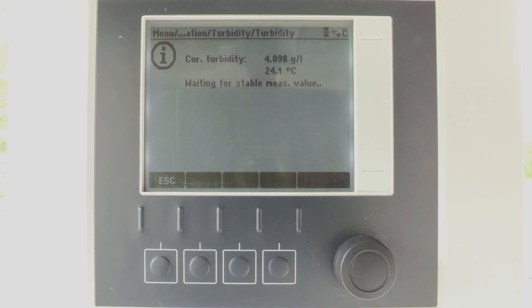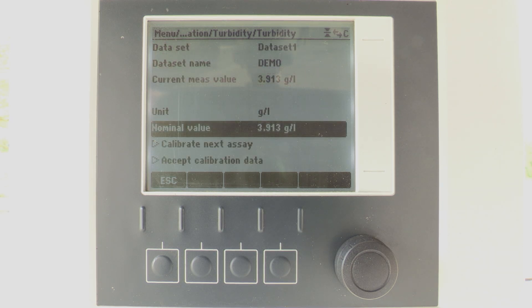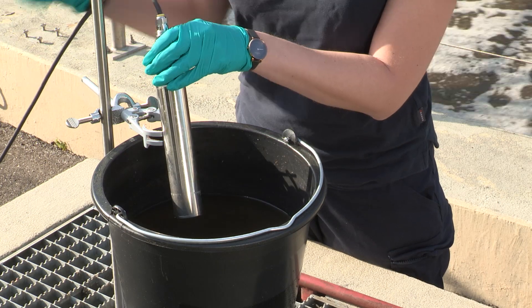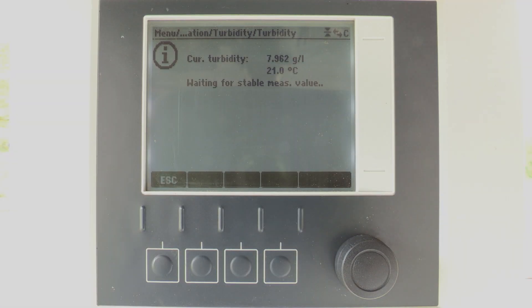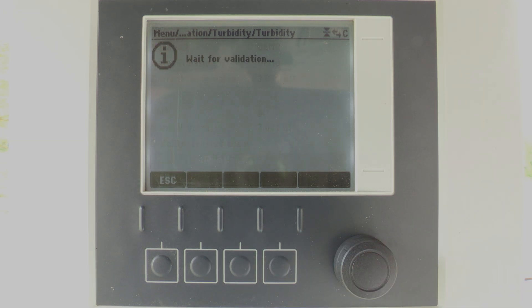It may take some minutes for a stable measuring value. Please don't take out the sensor. When the calibration was successful, the following menu appears. Here we see the current measuring value and the nominal value. For now we keep the nominal value until the lab value has been determined. Now we can add the next calibration point by selecting 'calibrate next assay' and follow the procedure as previously. After all calibration solutions have been measured, we select and press 'accept calibration data'. Our calibration data are now being validated and stored in the sensor. Then we can press OK to finish it.